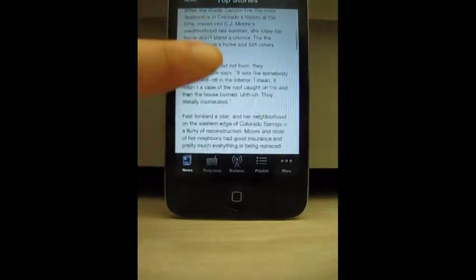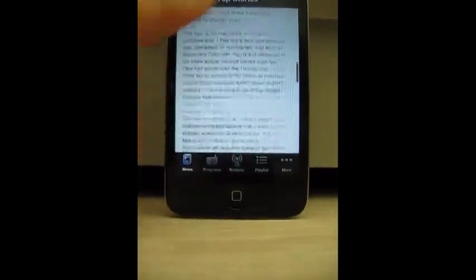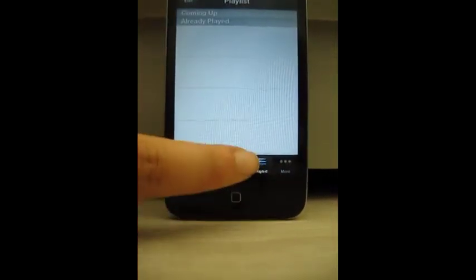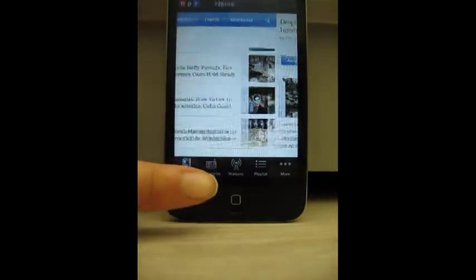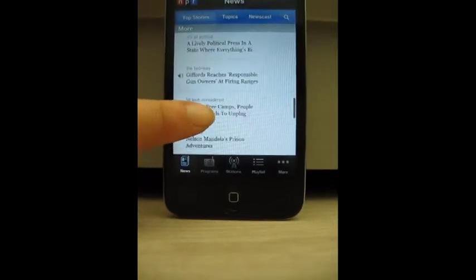Today, we will be looking at the friction coefficient of a touchscreen and a simulated finger using the flat face with a silicone rubber attached. We will take a look at the clean screen, similar to right out of the box conditions. While the friction between the screen and your fingertip may not be the most crucial factor when considering a touchscreen, it is an interesting thing to consider if you wish to make a quality screen.